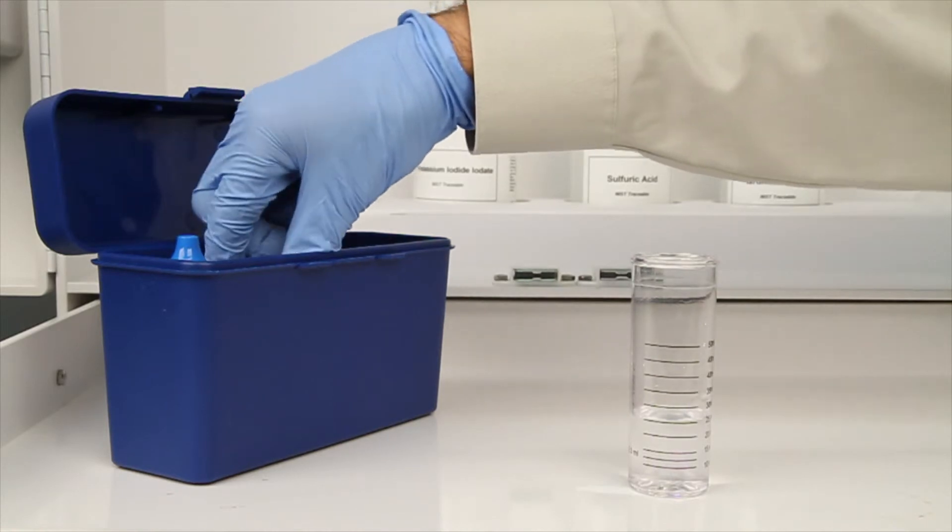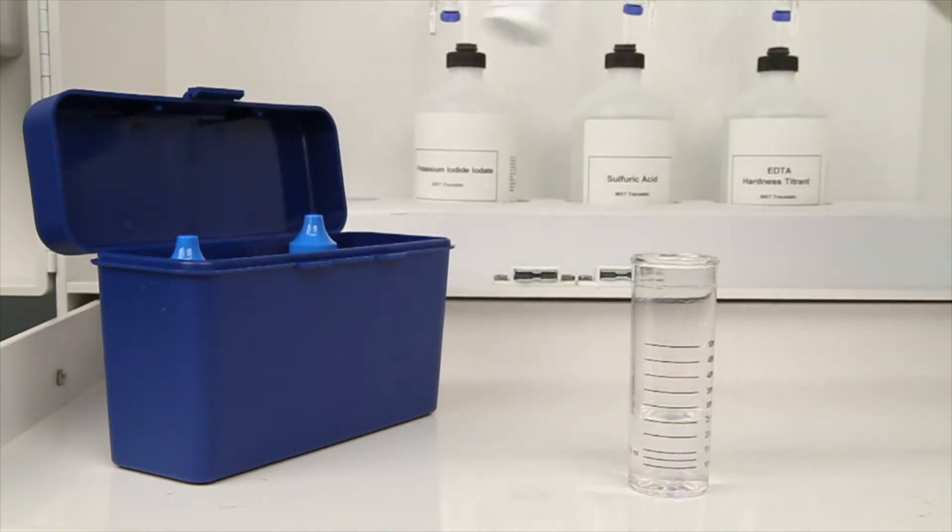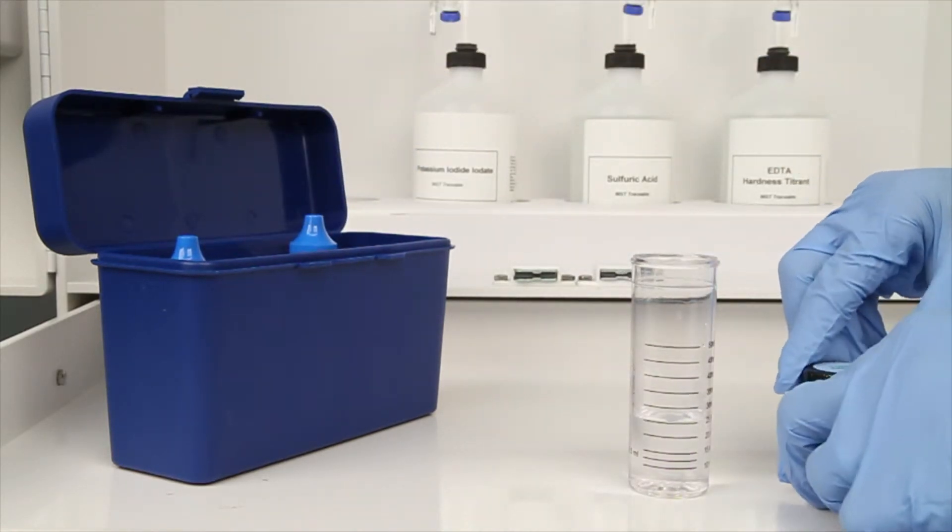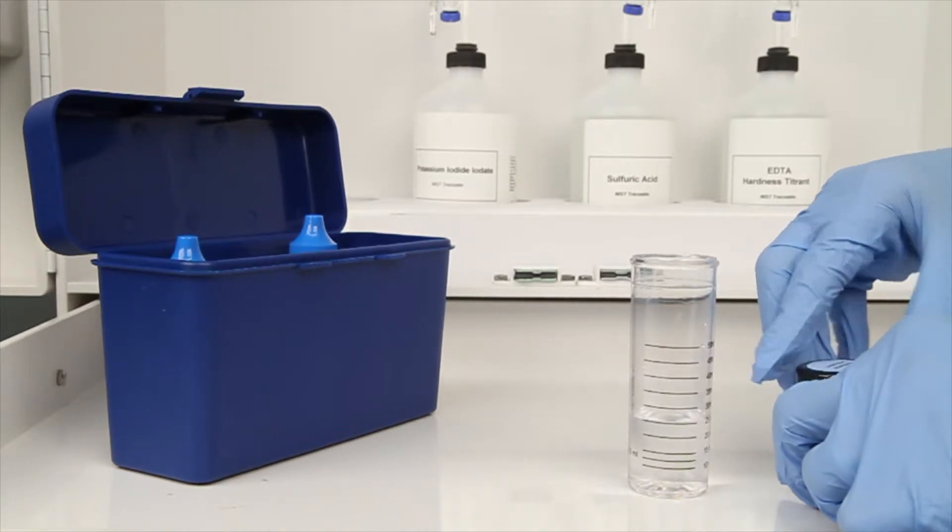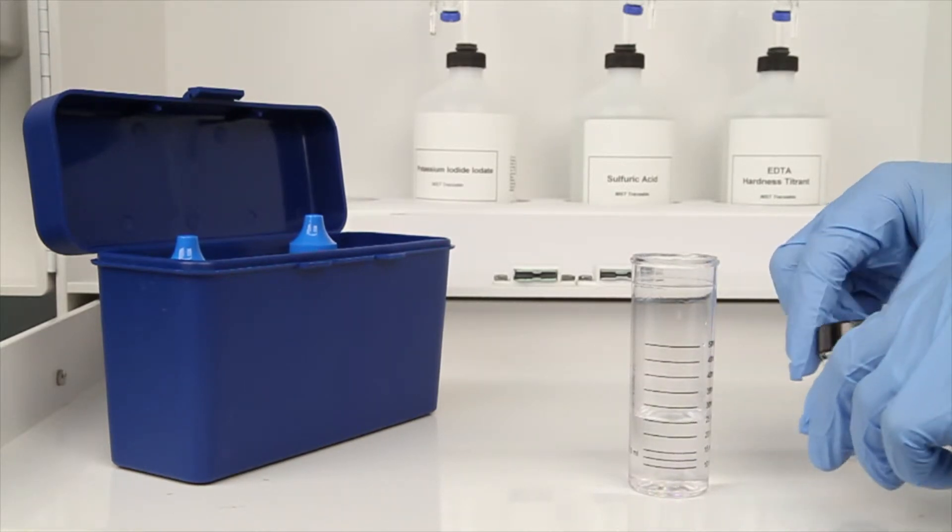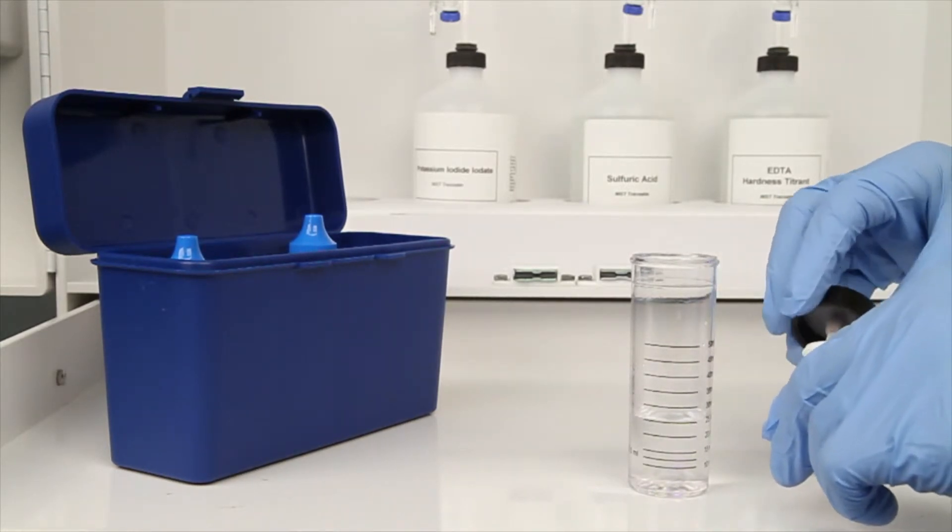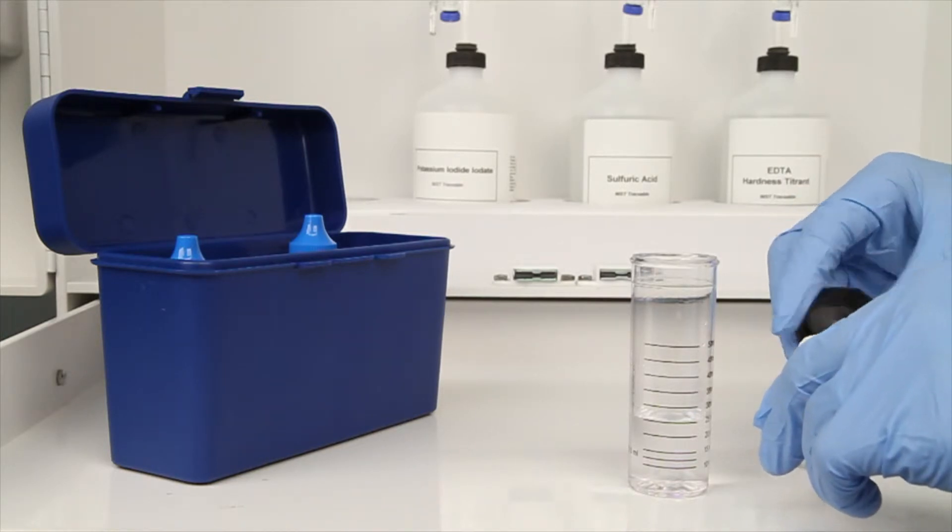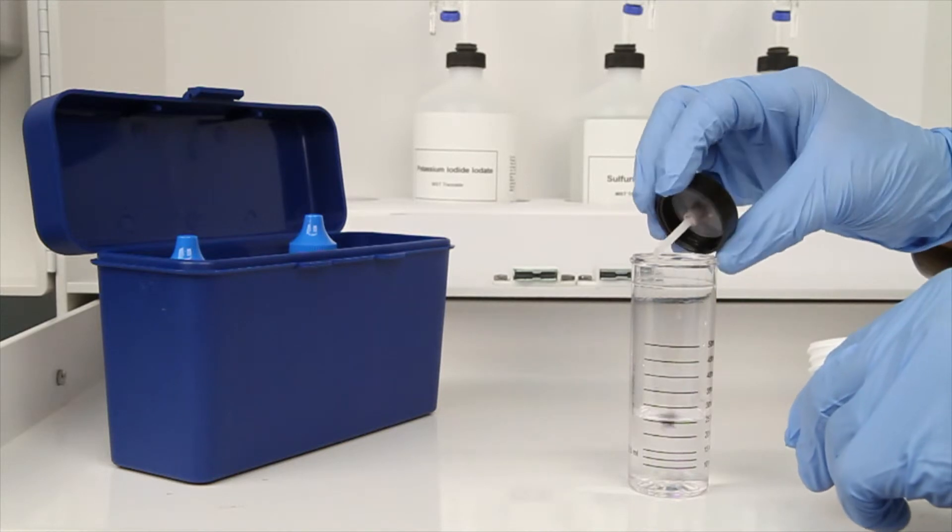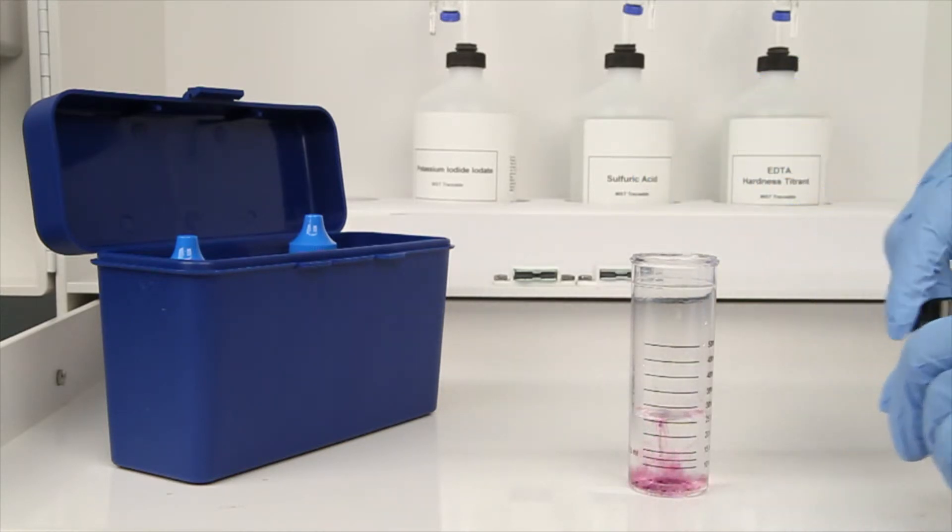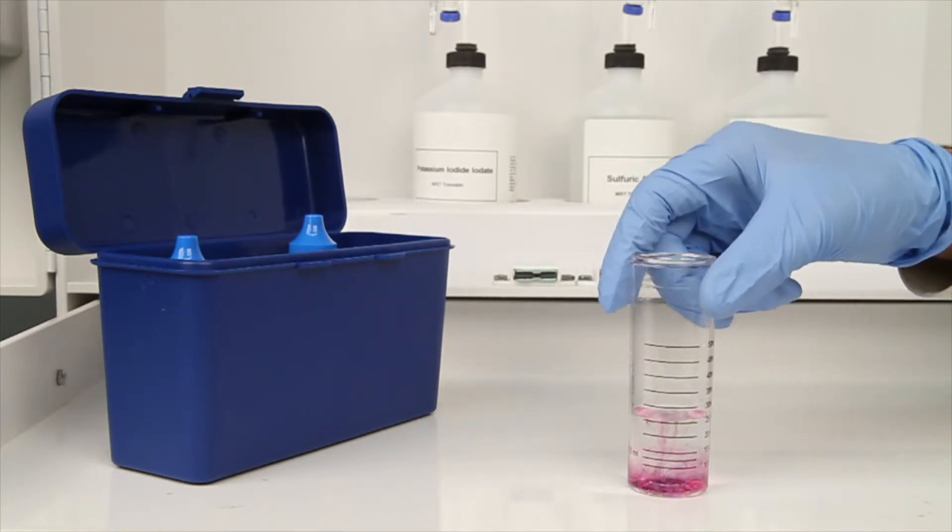The next step according to the Endpoint ID procedure is to add one scoop of calcium hardness indicator powder. After the addition of the powder, swirl the vial to make sure the powder is completely dissolved.